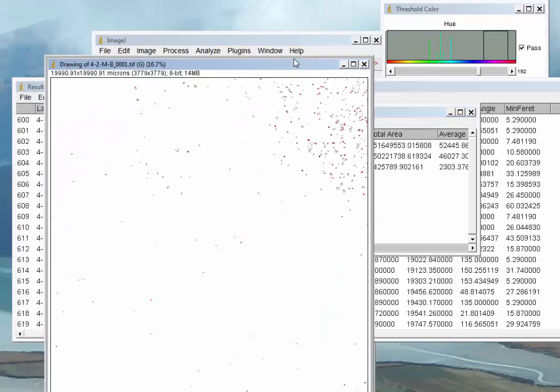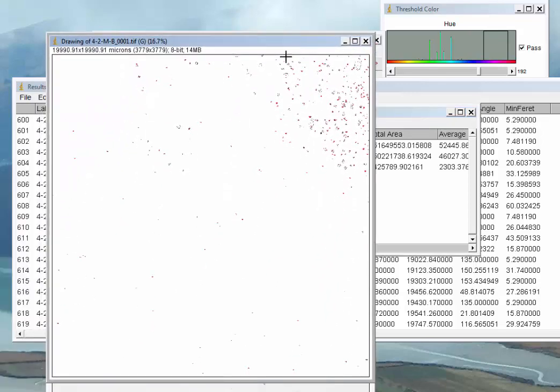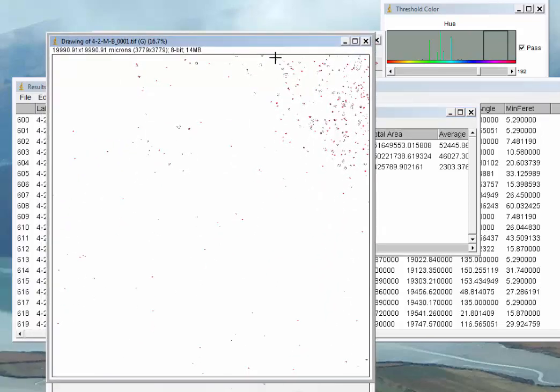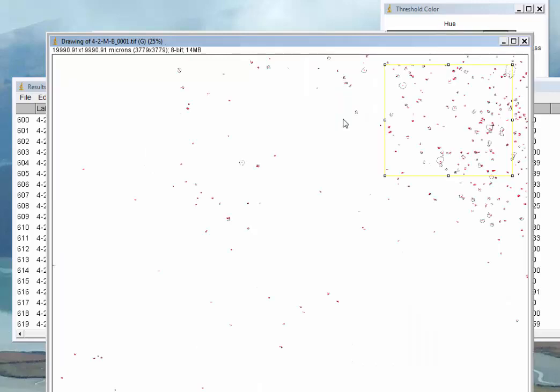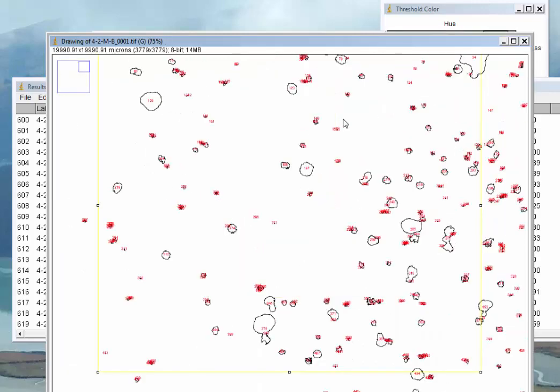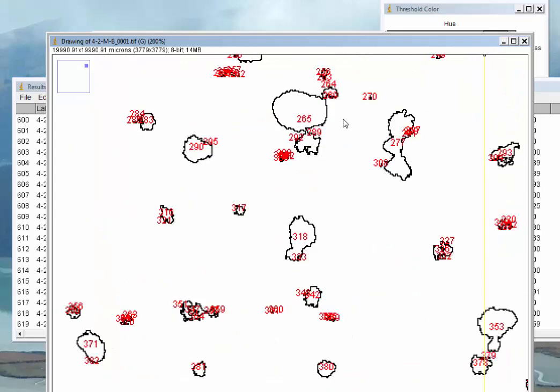It's generated our table of individual droplet stains. It's added a summary here. We get 600 stains at this point. The neat thing is it's now created this extra overlay image. We're going to zoom in. This doesn't look like much—it looks like a bunch of static—until you start to zoom real close. We just right-click and drag and drop to create a selected area, and then we hit Ctrl+.